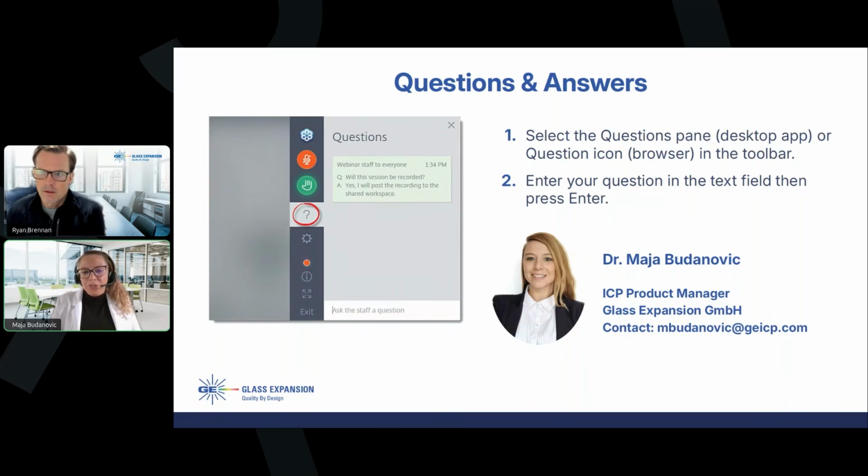So for any changes, probably for accuracy, you would check your internal standard recovery, nowadays online internal standard recovery, and also the RSDs. Thank you, Maya.